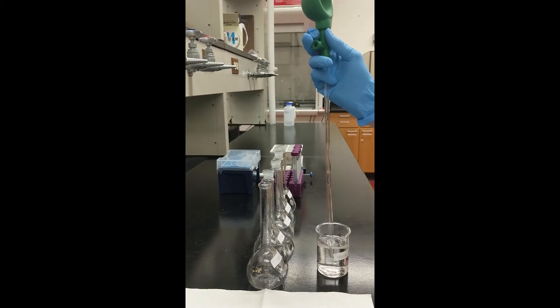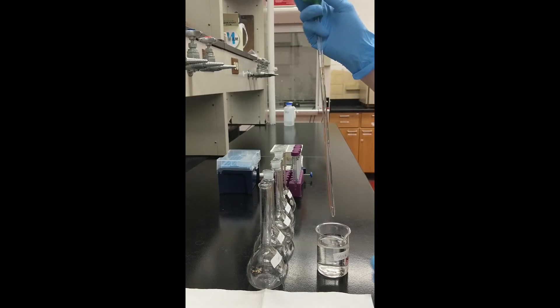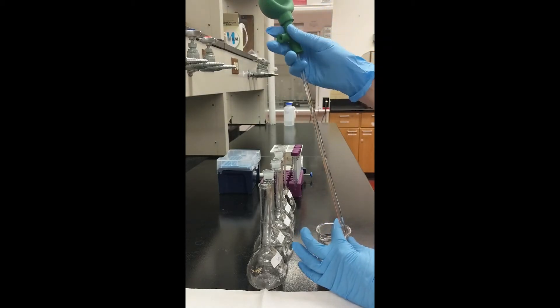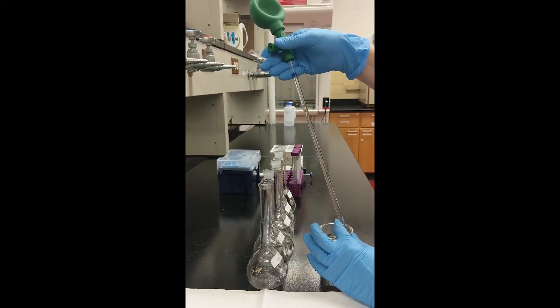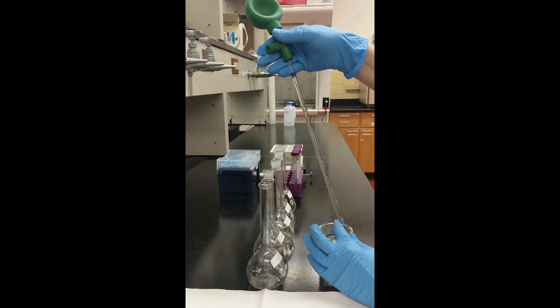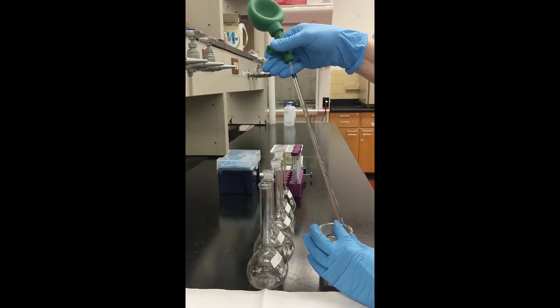Press the end of the pipette into the stock standard solution so that the tip is fully submerged. Press the S button on the bulb to fill the pipette by drawing liquid up until it is higher than the fill line. Then slowly press the E or delivery button until the meniscus of the liquid is equal with the fill line.